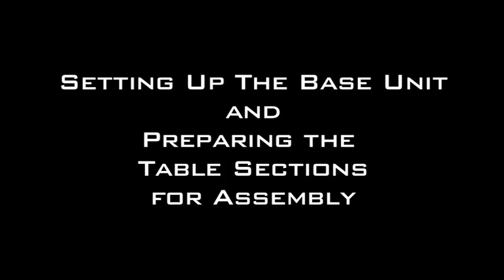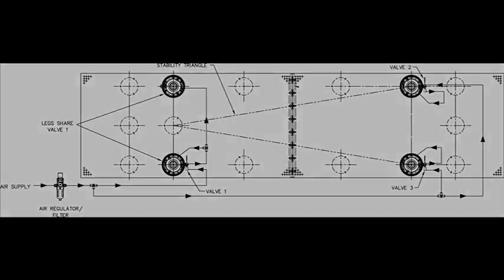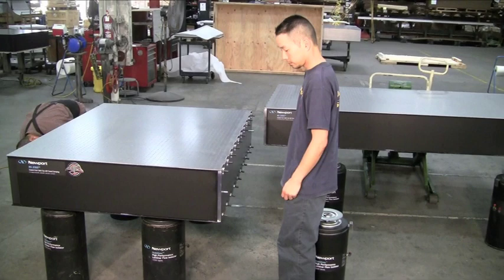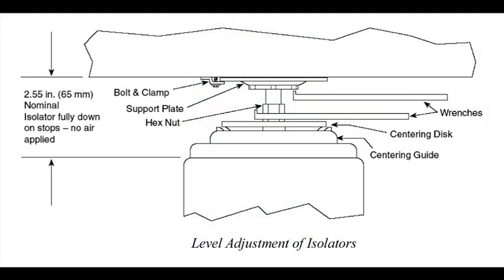Setting up the Base Unit. Refer to Newport's isolator or leg assembly instructions to set up one section of the doubler system to serve as the base unit. It is recommended to use a minimum of four legs to support the base unit initially, and if necessary relocate the other support legs after final table assembly. Be sure to properly install the leg system so the table and legs are both level. Newport isolators feature a compliant ring along the bottom to compensate for minor irregularities in floor flatness. In some installations, additional measures like shims or grout may be needed to correct for gross irregularities.